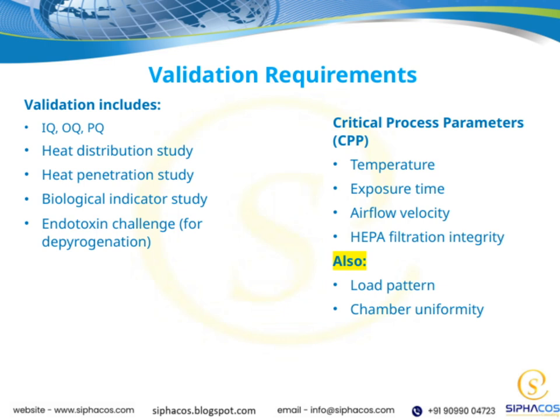Airflow velocity is another critical factor. Proper airflow ensures uniform distribution of heat or sterilizing agents throughout the chamber, preventing cold spots or uneven sterilization.